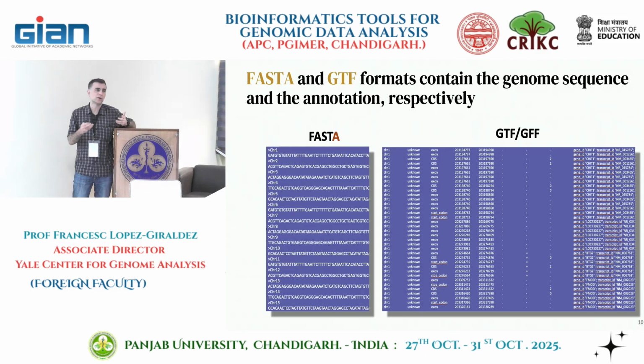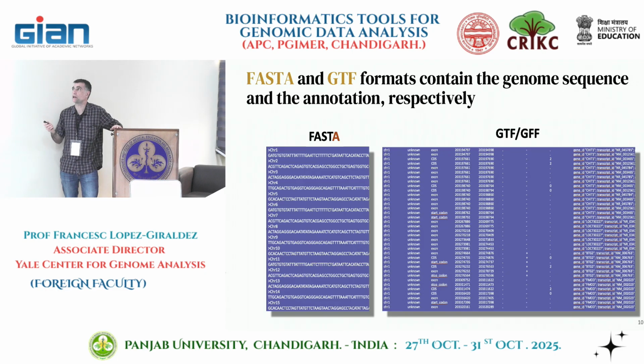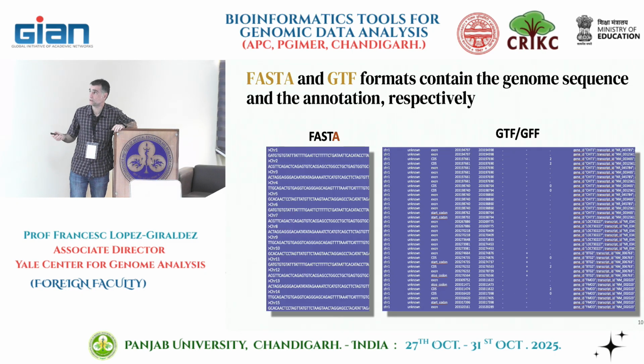I mean, all of them look alike in the sense that you're going to have some positional information, right? Chromosome. Yeah, this is basically annotations. That's how we store annotations. They have different extensions or names depending on the version, GTF or GFF. But that's the idea. This is how we annotate coordinates for something.